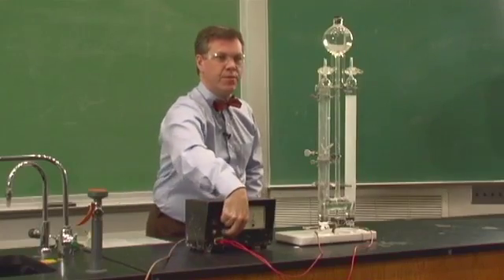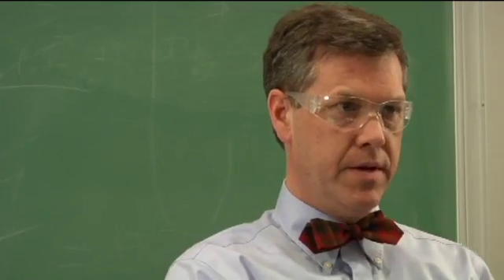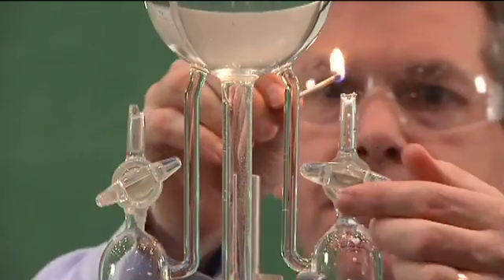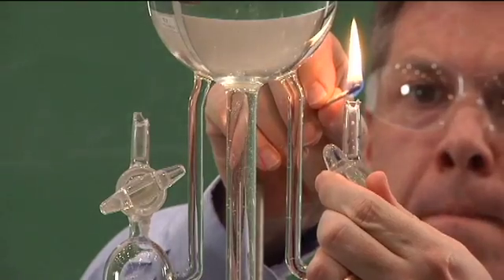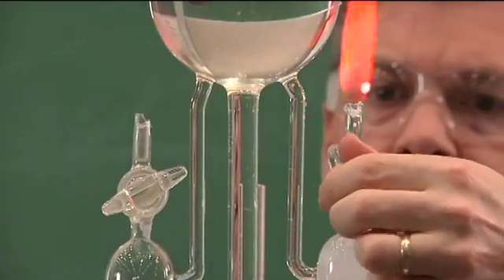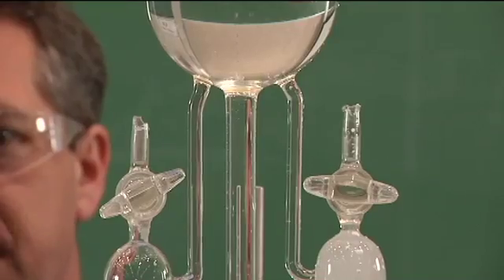We can test to see that we've really generated hydrogen gas by setting a small flame with our hydrogen. And so we see it burn. If we were to light this side, we wouldn't get any flame at all.